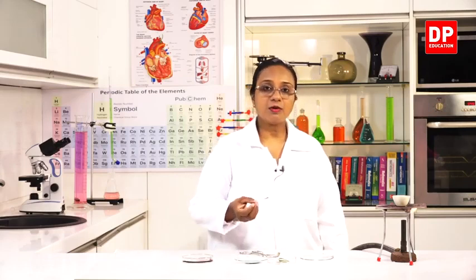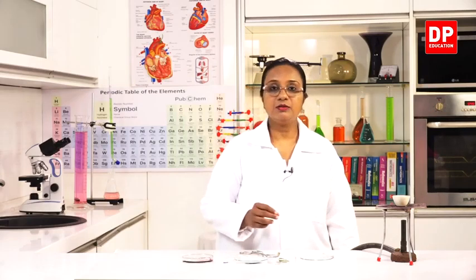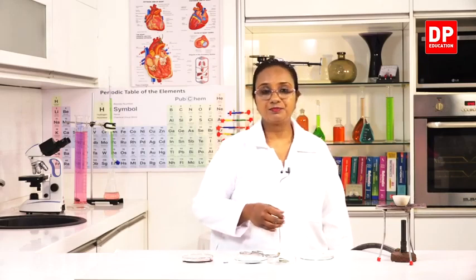So with this observation, we can conclude that there was water present in the leaf sample. That means there is water in food samples as well as living organisms. Okay students, now we will do the activity to test for the presence of carbon in food samples.